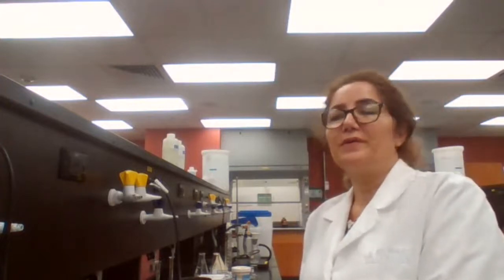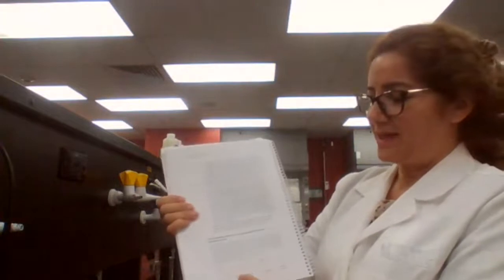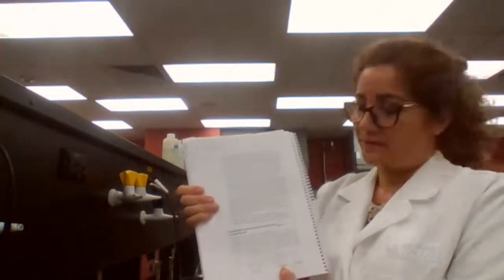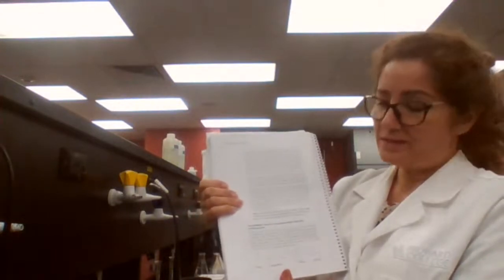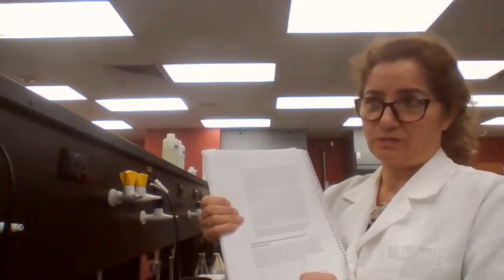Very good. The chemical reaction that you are performing today is the reaction of aniline with acetic anhydride, that will produce acetanilide and acetic acid. So the desired compound for us is pure acetanilide. If we have two reactants, and sometimes a catalyst, or more than two reactants, we don't always have a fixed ratio where everything is consumed entirely.